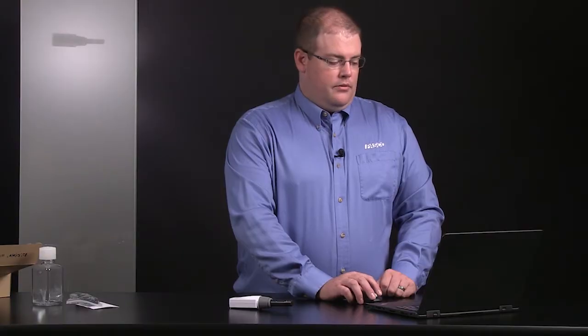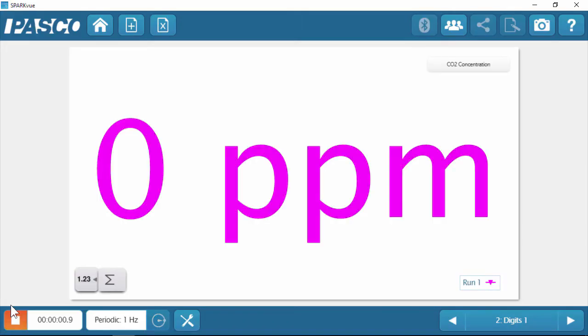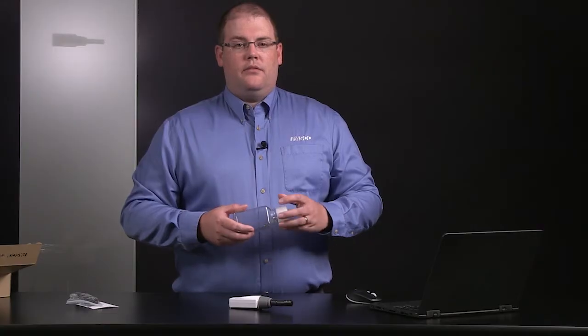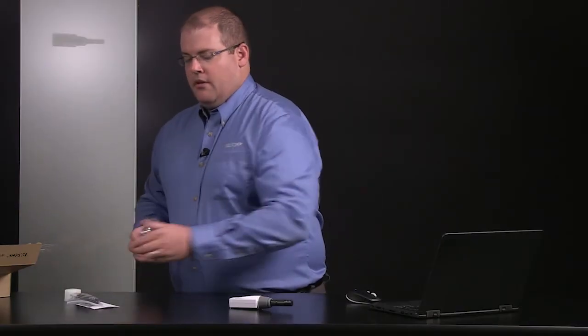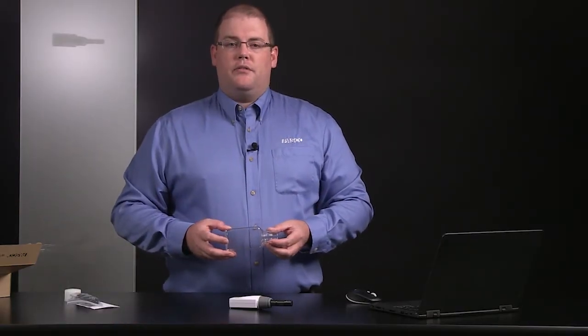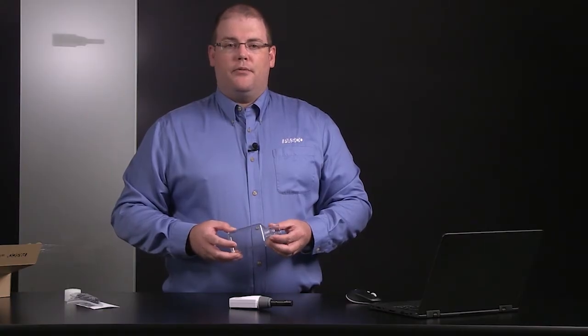To do a quick introductory demo, I'll begin data collection and simply exhale into the sample bottle. The sensor can go up to 100,000 ppm, or 10% CO2 concentrations, which is more than high enough to measure respiration of humans.